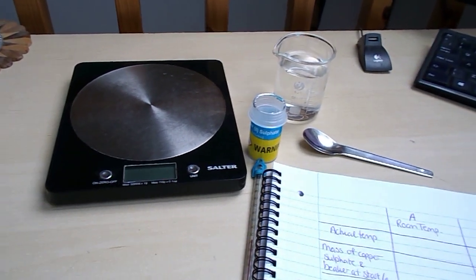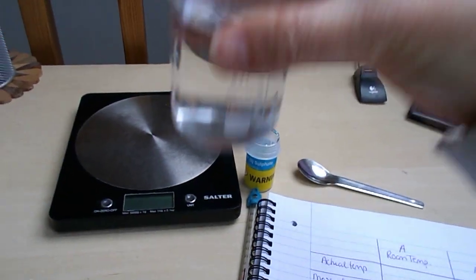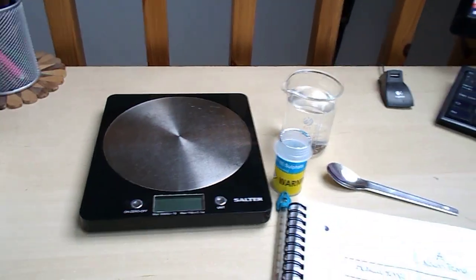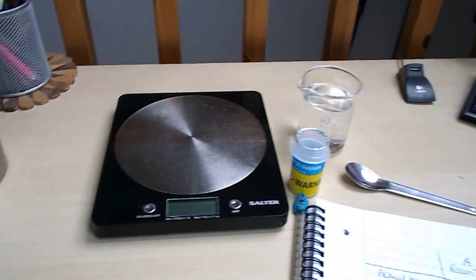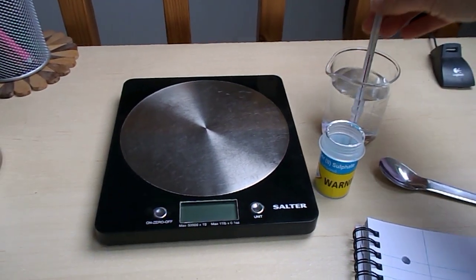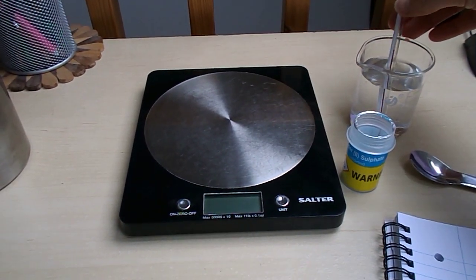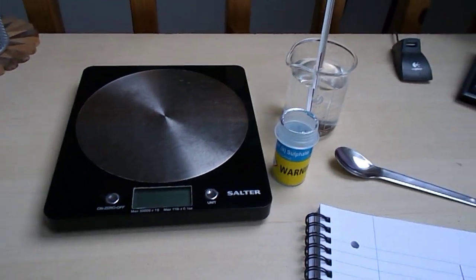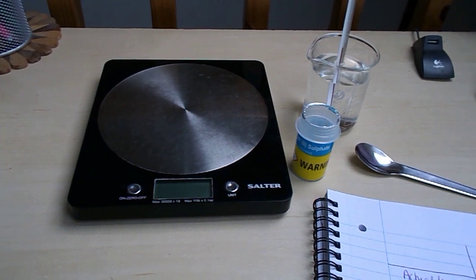So in your method you were told that you need 100 centimetres cubed of distilled water, so we've got our water there. We're going to need to measure the temperature of it, so I will put the thermometer in there just while we have a look at the rest of the apparatus and record that in a minute. It'll need a little bit of time just so that it takes on the true temperature of the water.